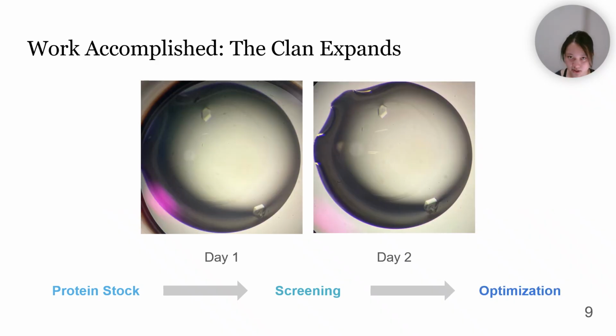To generate larger crystals, I've repeated my hit conditions in a larger drop format. Once again, on the very first day I observed crystallization, with the appearance of 2 new members of the crystal clan, Kendall and Kylie. We will continue to monitor their growth as well as fine-tune the concentration of precipitants in future experiments to see if the crystals can grow any larger.